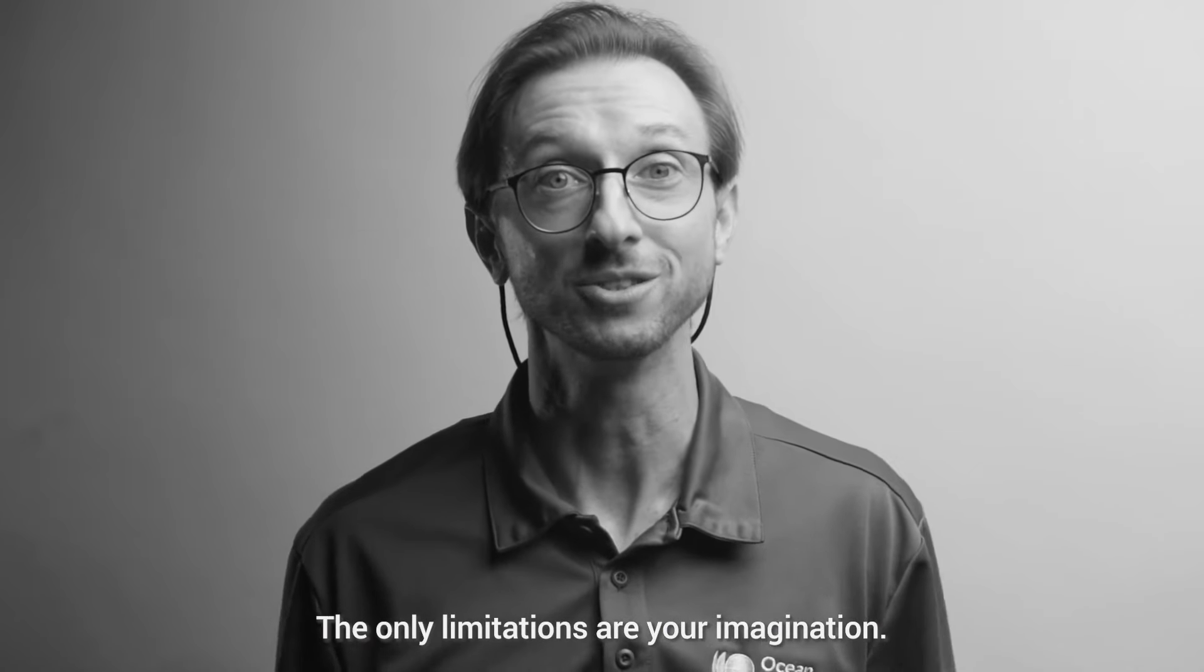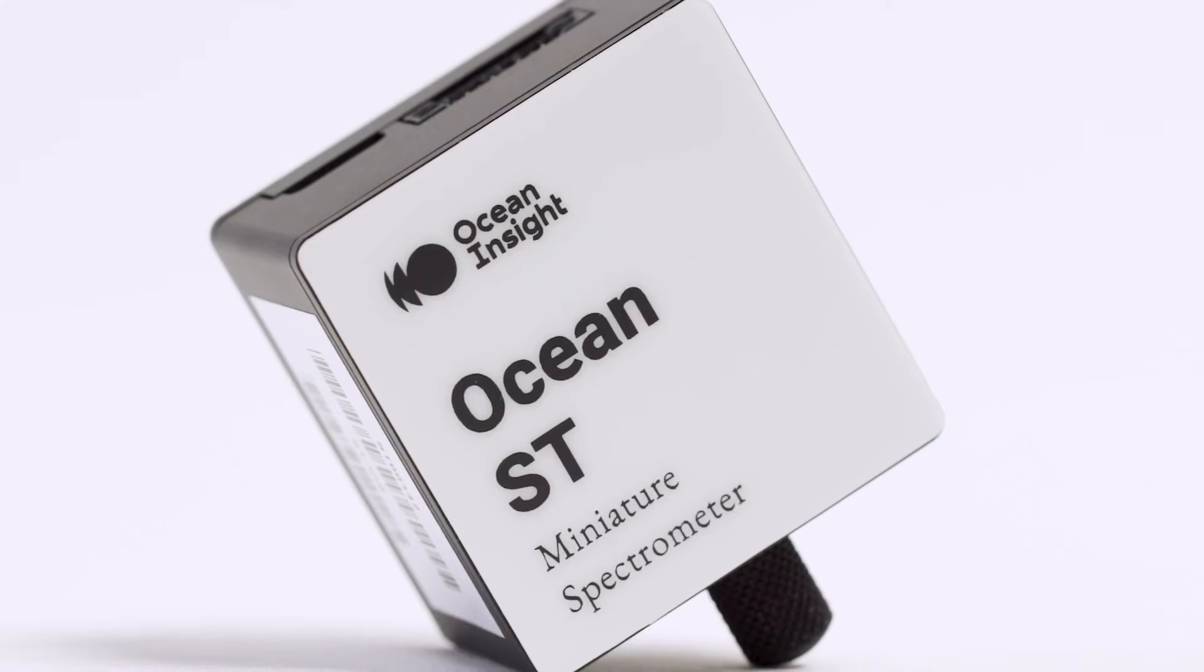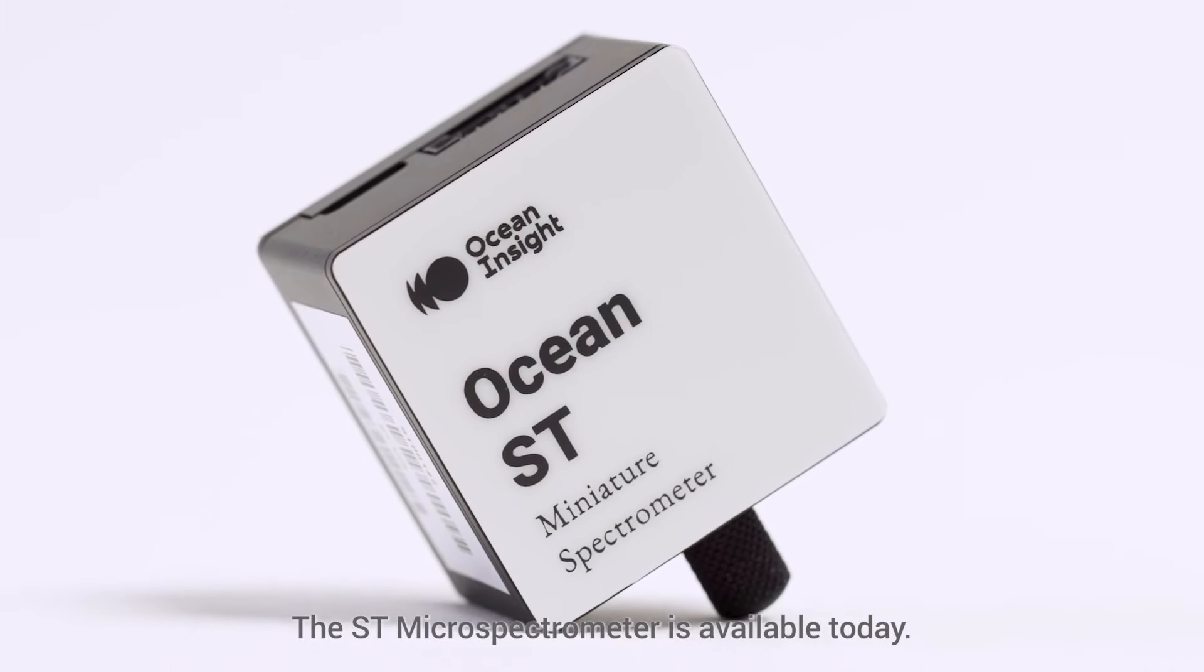The only limitations are your imagination. The ST microspectrometer is available today.